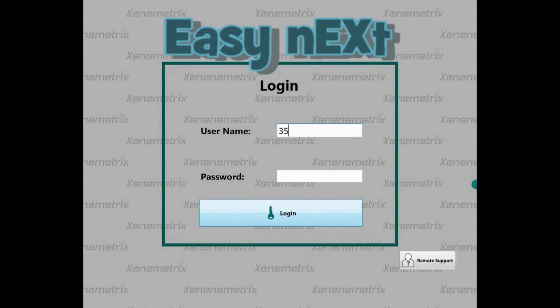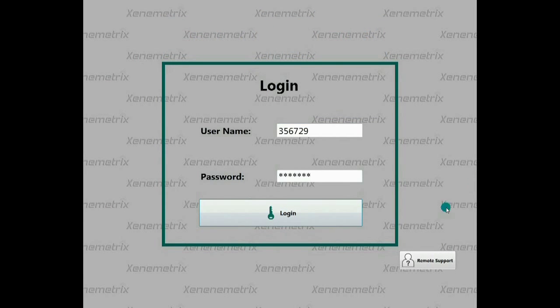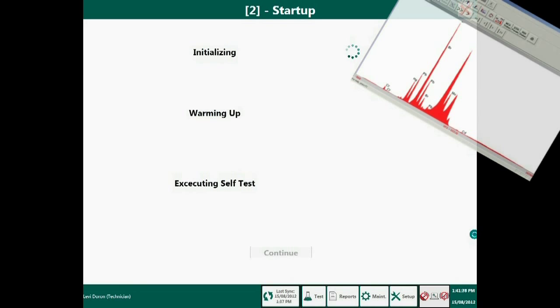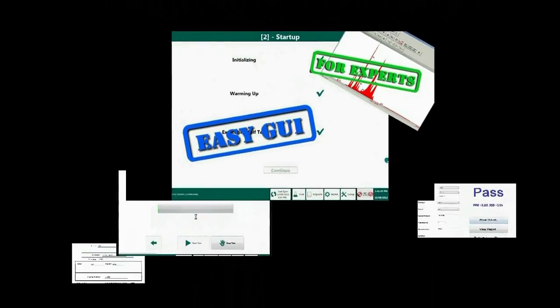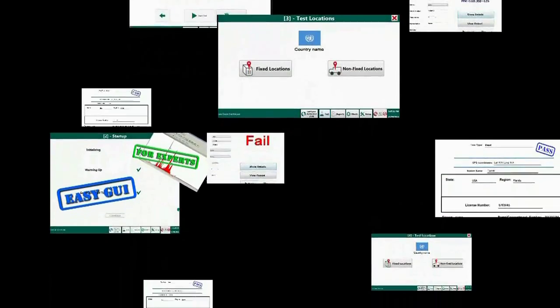Easy Next is state-of-the-art, unique, and new software supporting the excellent Xenemetrix Next package for elemental analysis. The Easy Next enables a simple-to-operate graphic user interface for non-skilled operators, from simple to very complicated analytical applications.